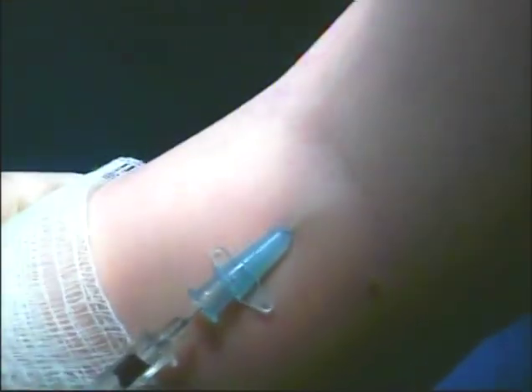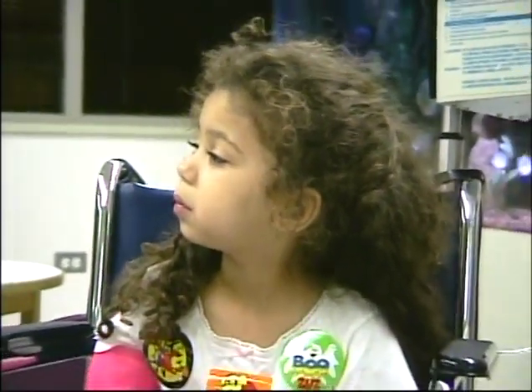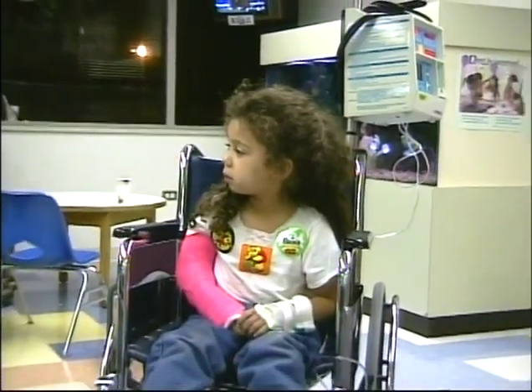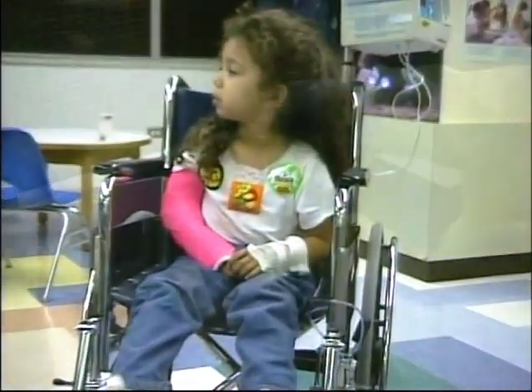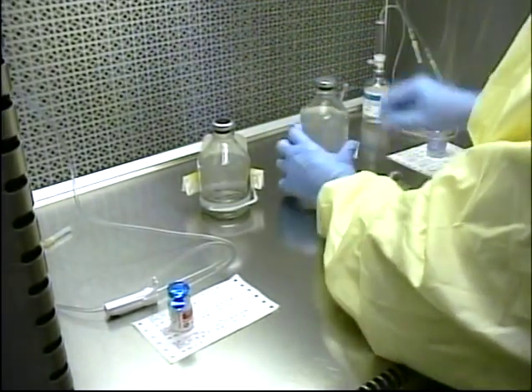The same characteristics that make IV therapy useful can also pose risks to the patient. Contaminants introduced along with the drug will also spread quickly, bypassing the body's natural defense systems, causing intravascular infection, life-threatening pyrogenic response, or dangerous occlusion of the microcirculation in the brain and vital organs. Absolute control is therefore required to protect the integrity of parenteral products.